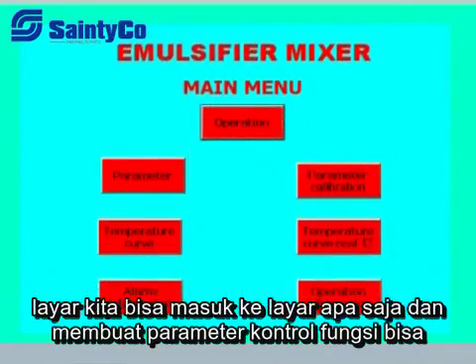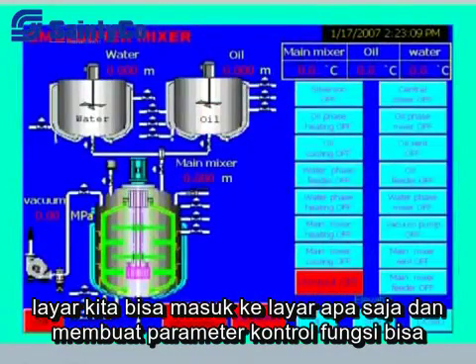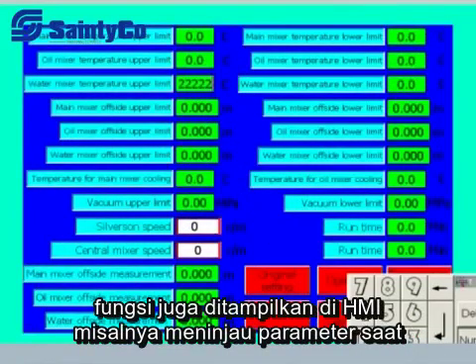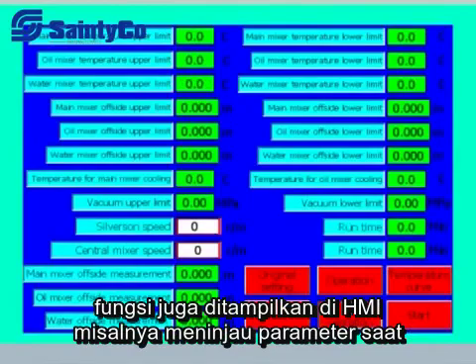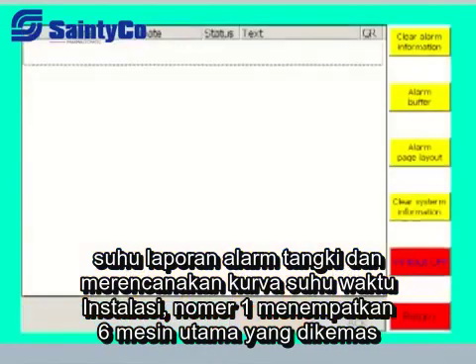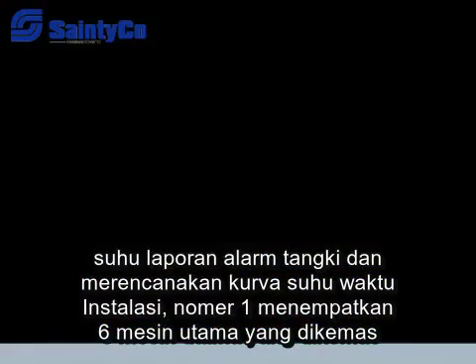On the function screen, any screen can be accessed and any function controlled. Parameters can be easily changed from the parameter setting screen. Other parameters and functions displayed in the HMI include review of current parameters, temperature of the tank, alarm records, and plotting of time-temperature curves.